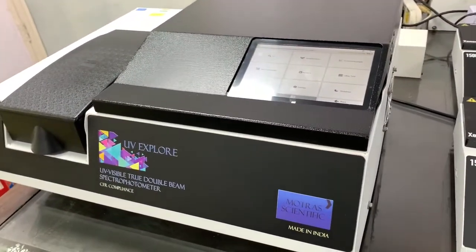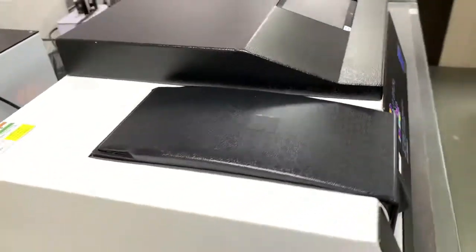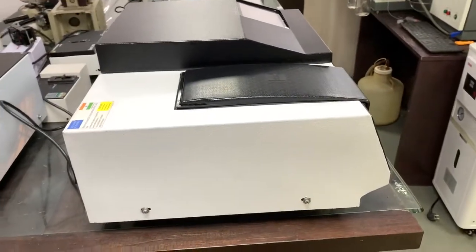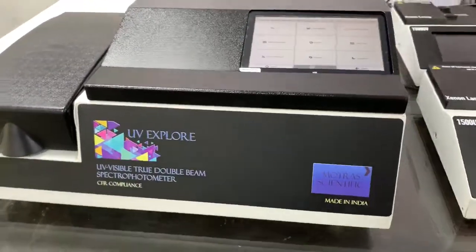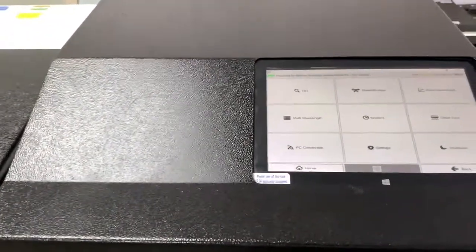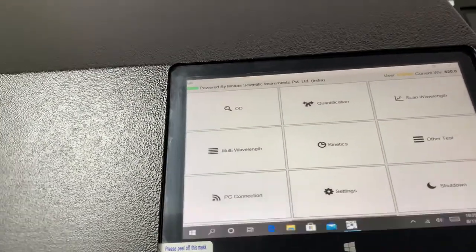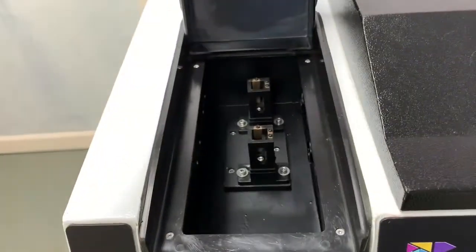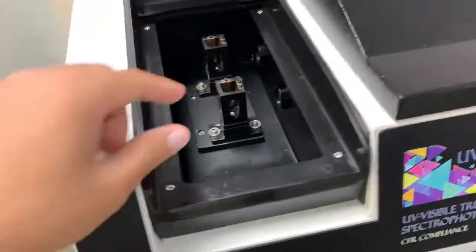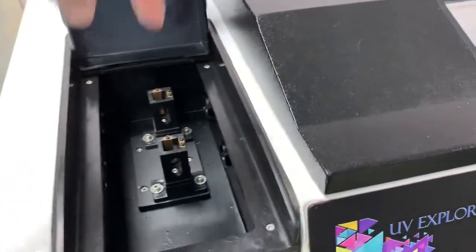This is our UV Explorer model. It's a double beam instrument. This is how it looks. We have a full touch screen on the display — this is the home screen. This is the sample chamber. We have a sample beam and a reference beam, so this is a true double beam system.